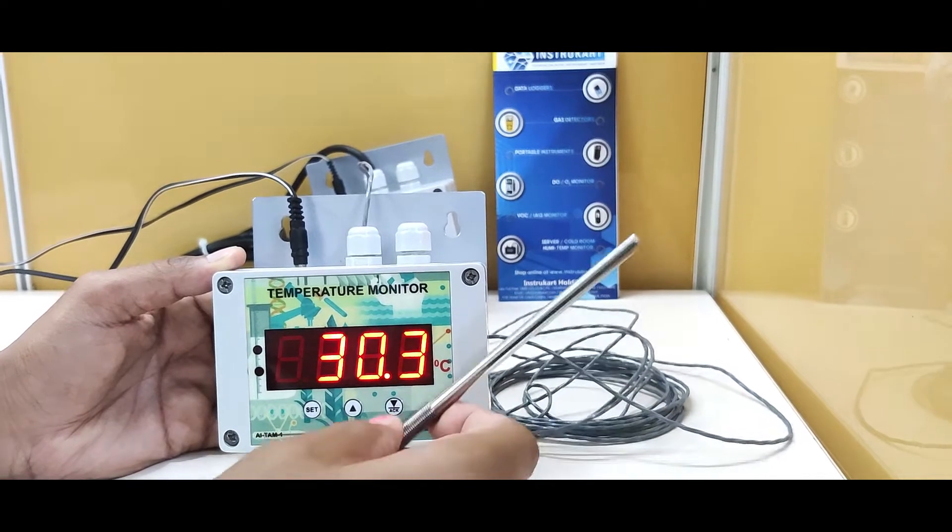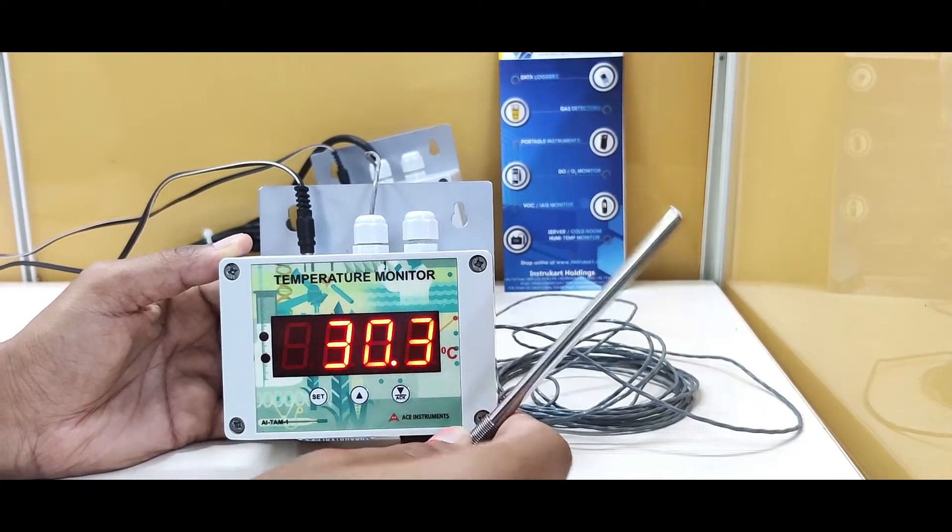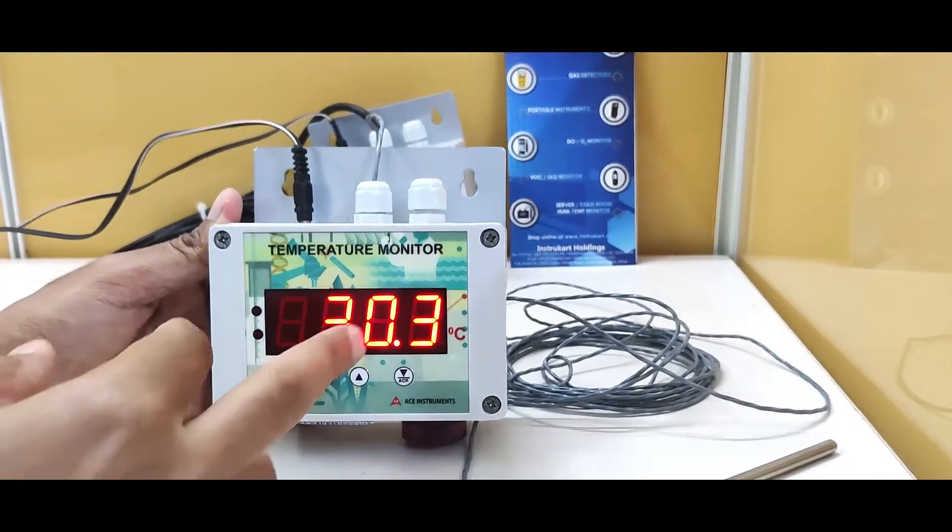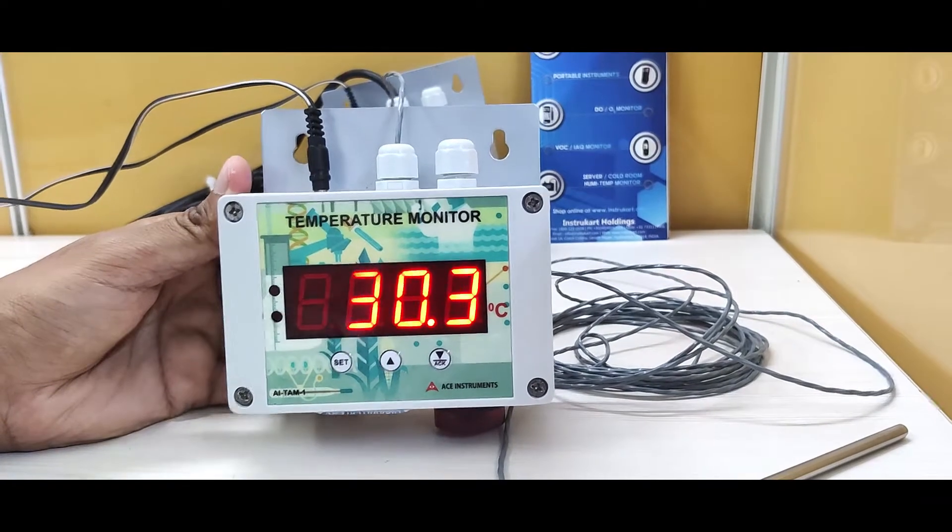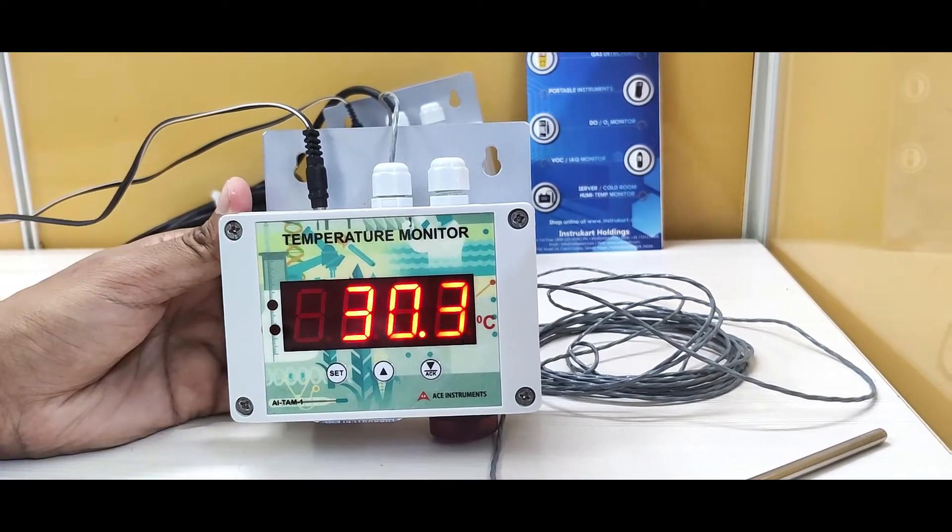It has an accuracy of plus or minus 0.3 degrees Celsius. You can see the super bright LED seven-segment display. This is 0.8 inches, however it can be customized based on your need.